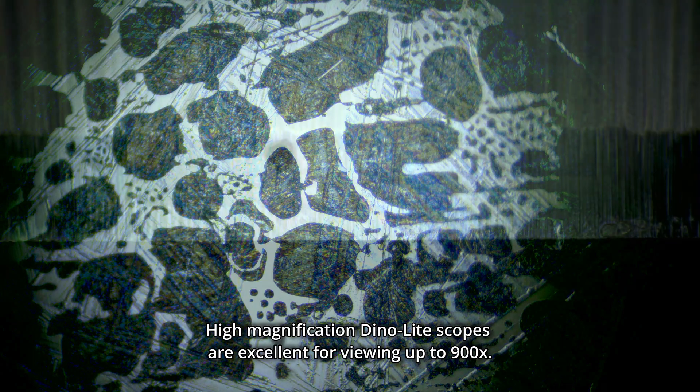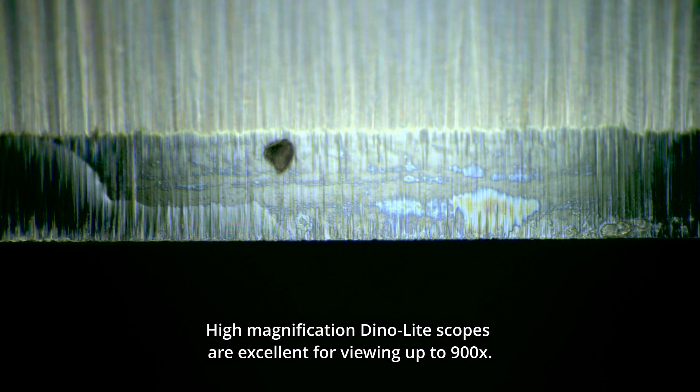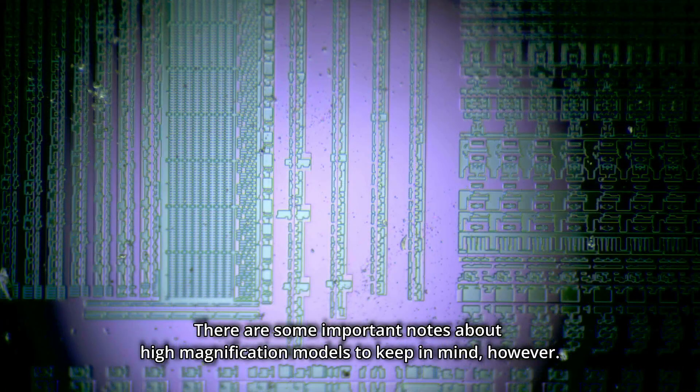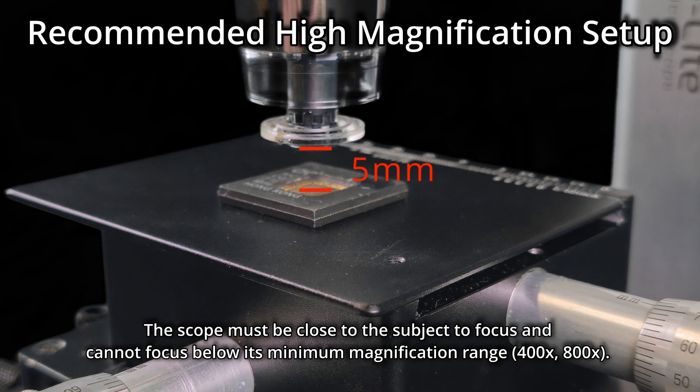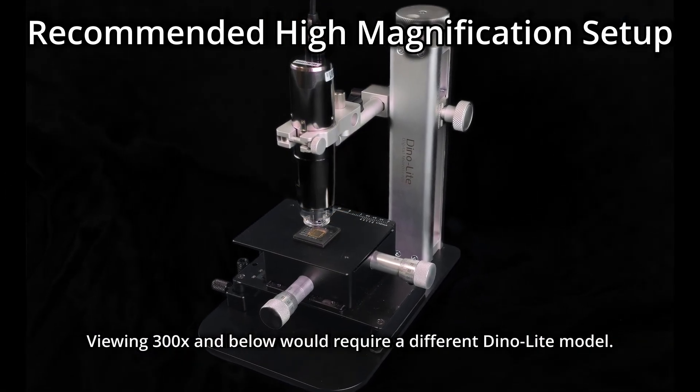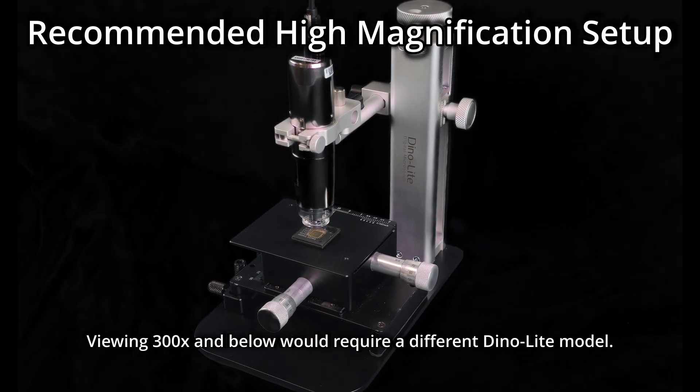High Magnification Dino-Lite Scopes are excellent for viewing up to 900x. There are some important notes about high magnification models to keep in mind, however. The scope must be close to the subject to focus, and cannot focus below its minimum magnification range. Viewing 300x and below would require a different Dino-Lite model.